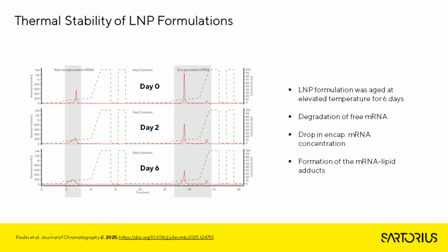The temperature was 35 degrees Celsius, and then we sampled it and analyzed it using this LNP switcher, and we can see, for example, at day 0, we have some amount of non-encapsulated mRNA and some amount of encapsulated mRNA and some small amount of adducts.